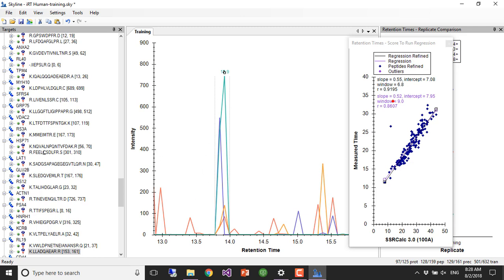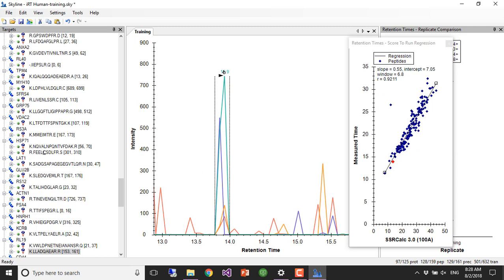Maybe that thing. That puts it right where it's supposed to be. So let's do that correction. This may be a case where the peak is narrow enough, and our fast cycle time makes it hard to measure. So let's make that correction.